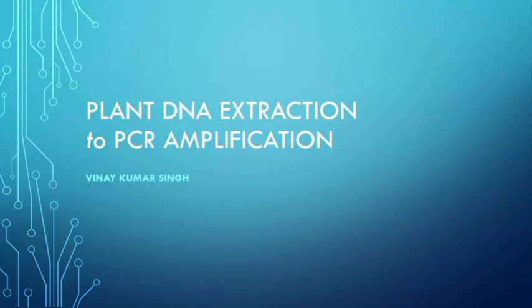I am going to present a PPT on plant DNA extraction to PCR amplification, because we need to identify a plant, or in other cases we need to identify bacteria or fungus. So DNA extraction is very important, and PCR amplification is very important, because after PCR amplification and sequencing you get the sequences, and those you use to blast to identify or to construct trees.